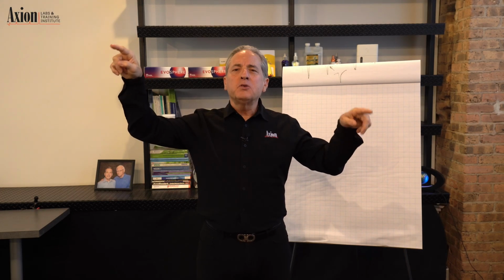So C18 columns, you would think they'd all be the same, but bonding density is different. I'll just give you examples from my past. Most C18s are going to be 15 to 18% carbon load. That's probably where you're going to be. Now, I believe it's a Waters Nova-Pak that had a 7% carbon load. That's the lowest one that I remember, a C18 down at 7%. And then Phenomenex used to make a column called the Ultracarb, and it was 30% carbon. So they were both C18, and you can imagine we range from 7 to 30%, but on the market today, you'll see 12% up to 18%.